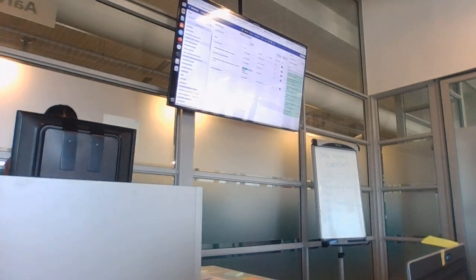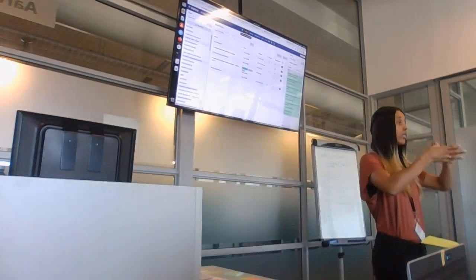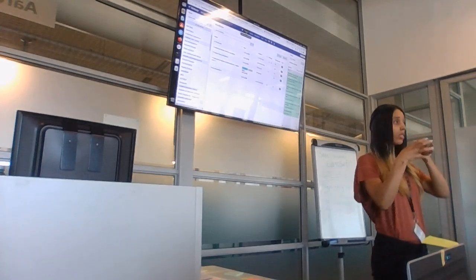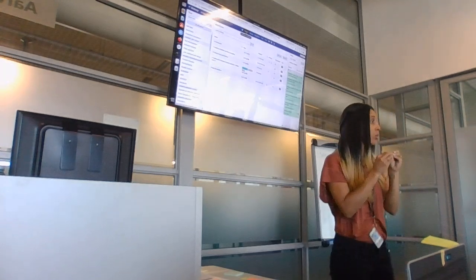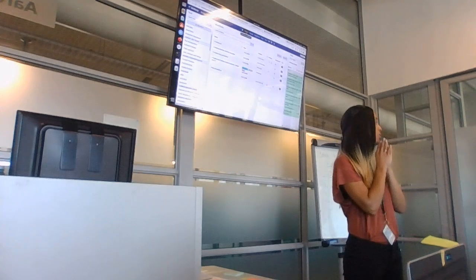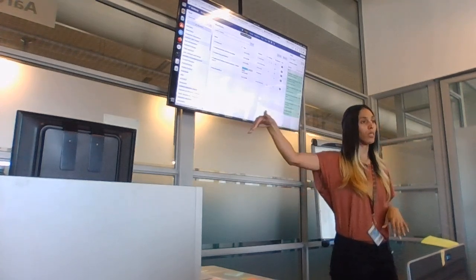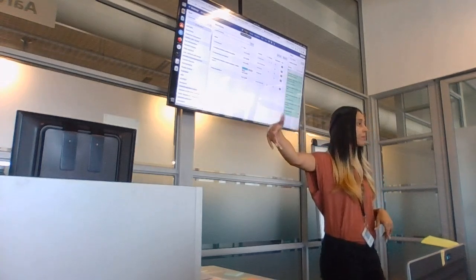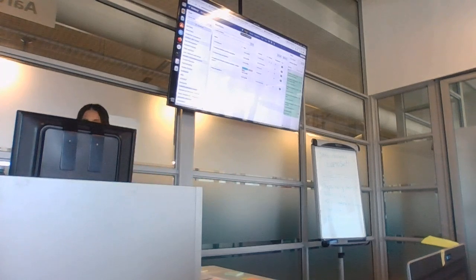But if you go to workflow, firstly, before I go on, did everybody understand what we did before? That you can create a workflow, that you can edit it, everything about it. You can edit what it's taking input from, where it sits between the tools, you could put it in between different tools, you can change the type of input, literally the same way that you would do it if you are in your history. And you can save it and you can export it in various ways.